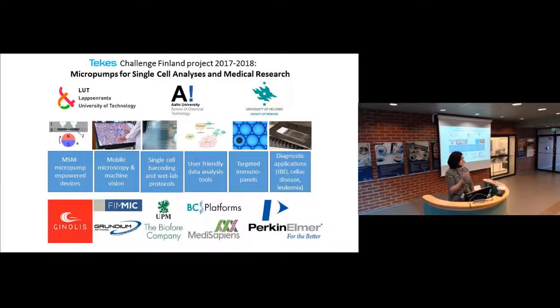Yeah, so when we cover, for example, one gene, I mean thousands of reads coming from the same gene, and we see the sequence, we can easily see what is real polymorphism, because if it's polymorphism in our germline DNA, then half of the reads should have the one allele and half the other one.